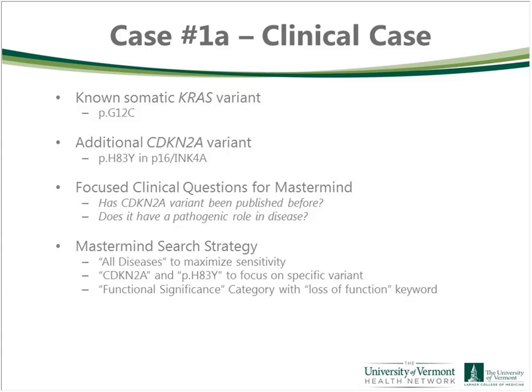But what was interesting about this case is in addition to the activating KRAS variant, we identified a variant in the CDKN2A locus, which encodes both P16 and P14. And this particular variant is predicted to be a missense variant at the 83rd position. So it's a missense variant, histidine to tyrosine, in P16. And I had not seen this variant before, and so I'm going to use this as a starting point for using the Mastermind software.